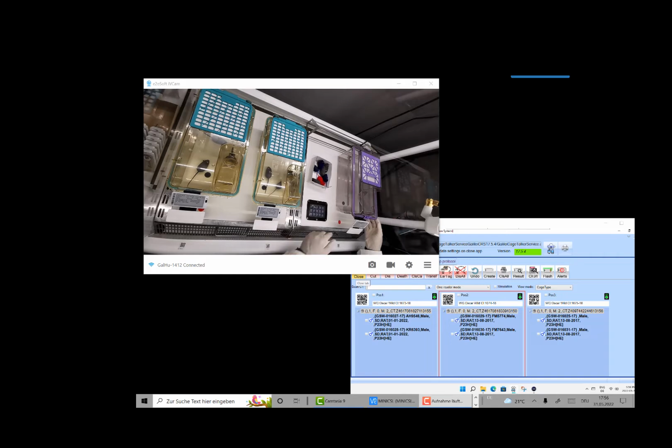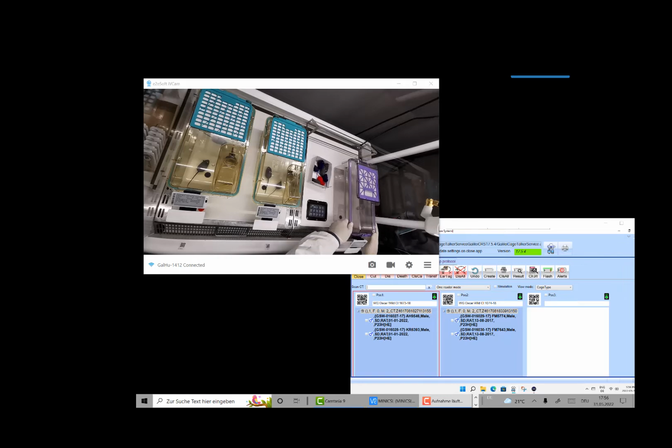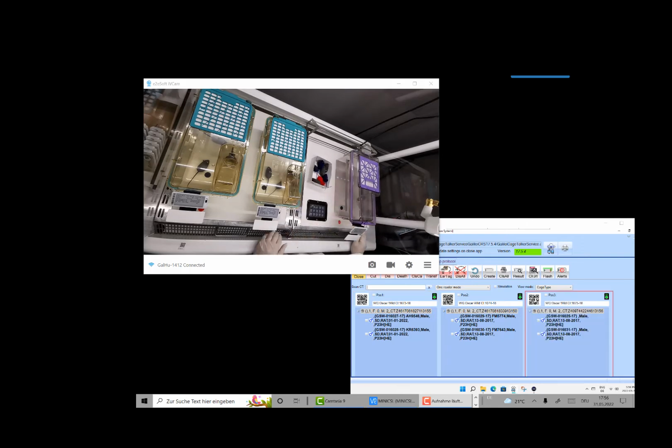So there are two ways. You could also just wait, and maybe what I did was not so clever to put them all up, because in this way you're automatically focusing on the cage and you've got the focus on that cage. So this is maybe easier then.